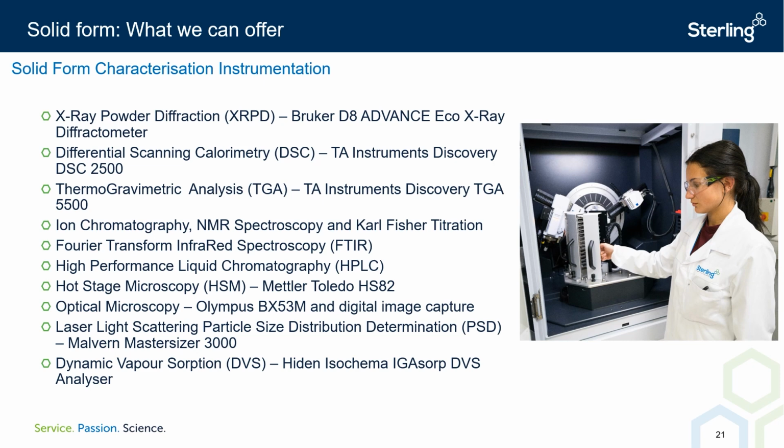The solid isolated following storage at either extreme of humidity can be examined by XRPD to assess for potential version change, such as affording an anhydrous version or a hydrate. Variable humidity XRPD, again available via outsourcing, could be employed to examine version change by XRPD across a range of humidity. The solubility of an API version in a given medium is most commonly assessed via HPLC.